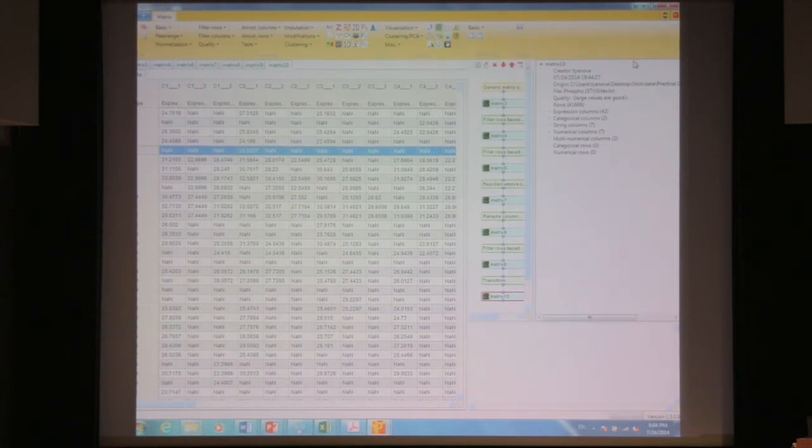But in answer to your question, in this case it's the highest. The global localization probability reported is the highest, and then quantitative information will only be shown in the experiment if the localization probability is greater than 0.5 for each experiment.